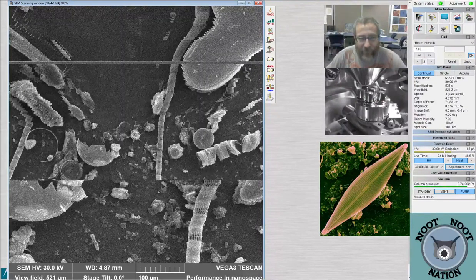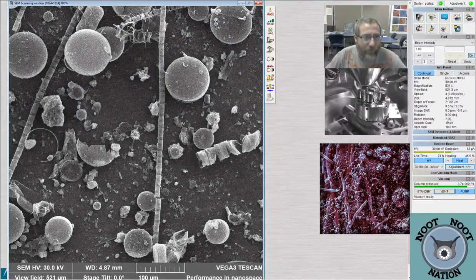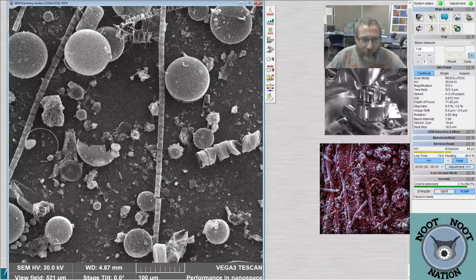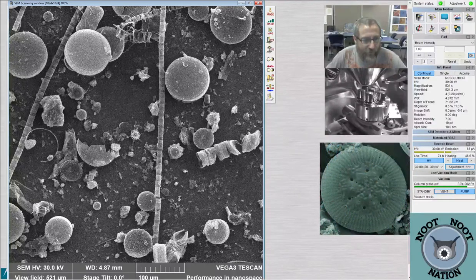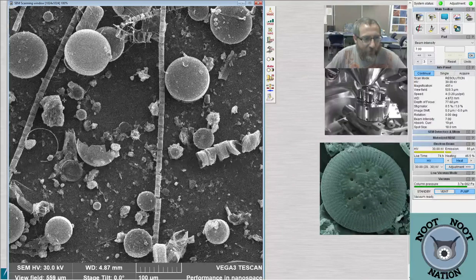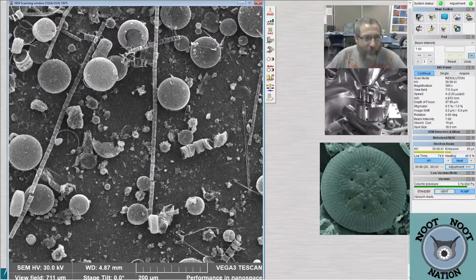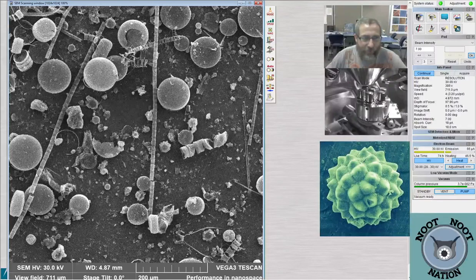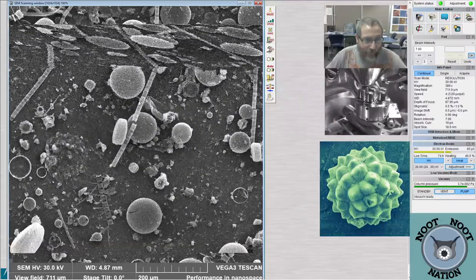And a lot of the lightly silicified diatoms, like this thing, might not make it through processing, especially if we put it in this one over here. Oh yeah, with those funny little spines. Yeah, that's super lightly silicified. Just landing on the stub and drying out seems like it's sort of wrecked it a little bit. So I don't imagine that putting it in some sort of heavy acid is going to make it last very long.